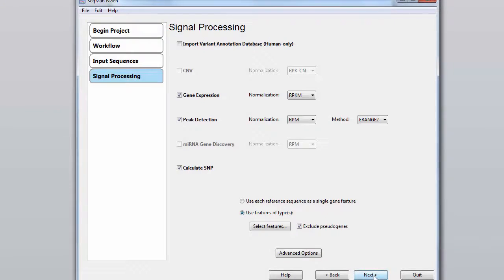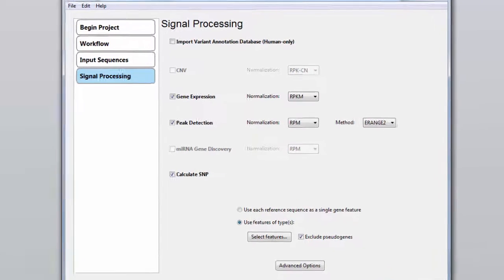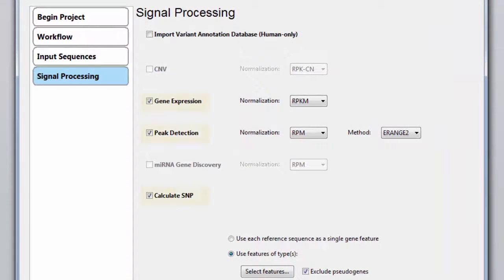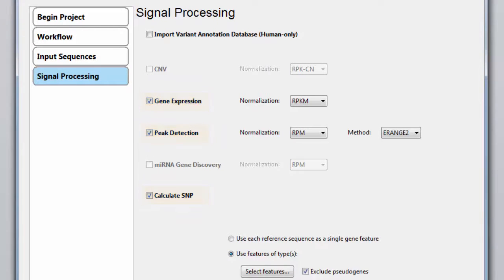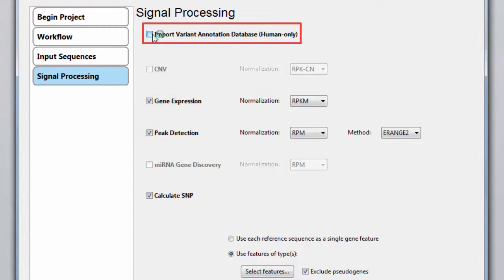Next, we can review the signal processing parameters. Note that the relevant analysis methods are already selected for me. And since we're using human data, I'm going to import the variant annotation database as well.